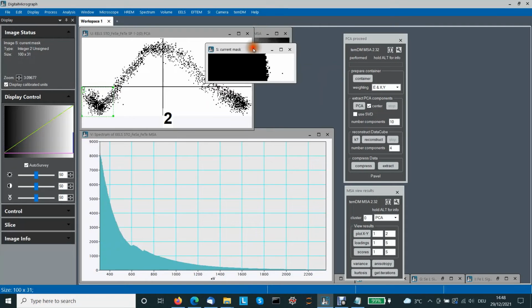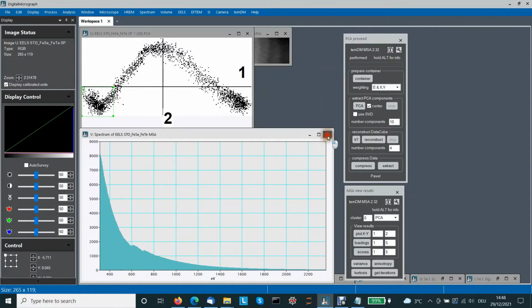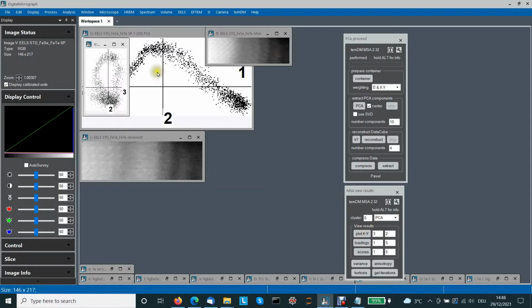Okay, well, that was a scatter plot using 2 principal components, but you remember there are many more. We can add the third axis and again plot the scatter plot.